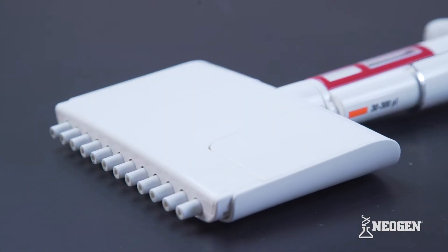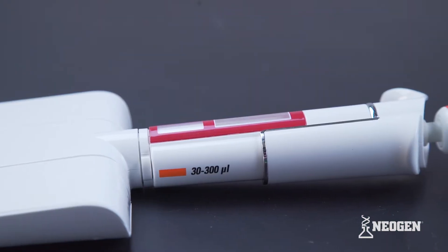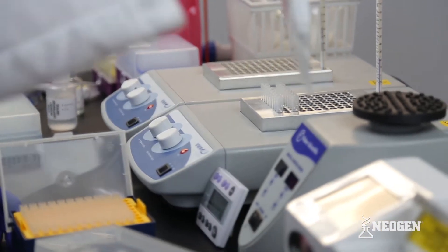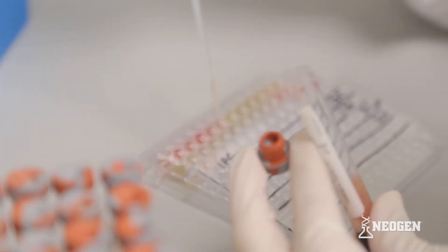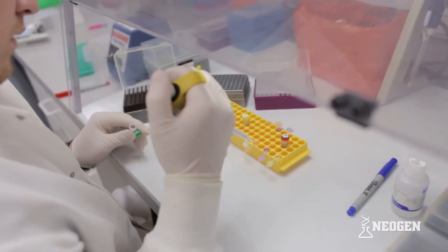This instructional video covers technical practices and procedures for using a multi-channel pipetter. Using correct pipetting technique is necessary to get accurate results with Neogen's test kits. If after watching this video you have unanswered questions, please contact your Neogen representative.